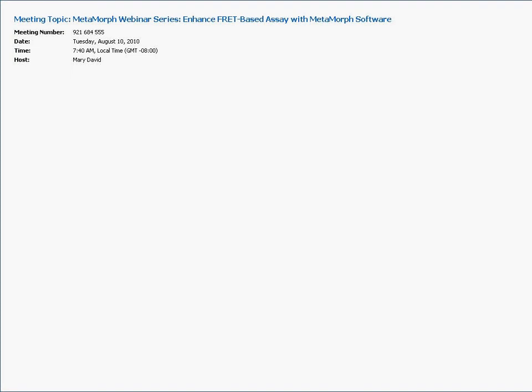So that's all I have within this. We do have a technical note on our website which walks through what images to take, typical experiment setup, as well as how to do this FRET efficiency calculation. Again, like I said before, as a software manufacturer, we're not entering into the discussion on what the best methods to utilize are. We provide you the tools to do the calculations that you need. If you have specific questions about the tools available, I'll be more than willing to entertain those.